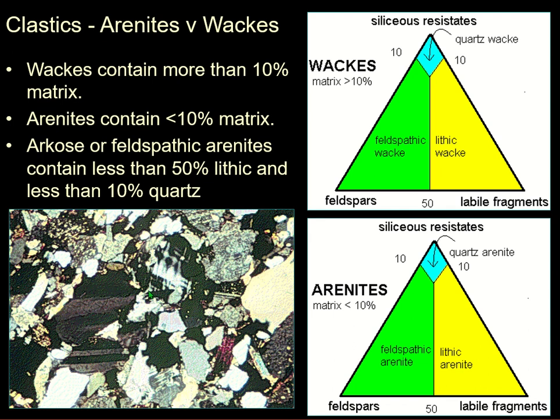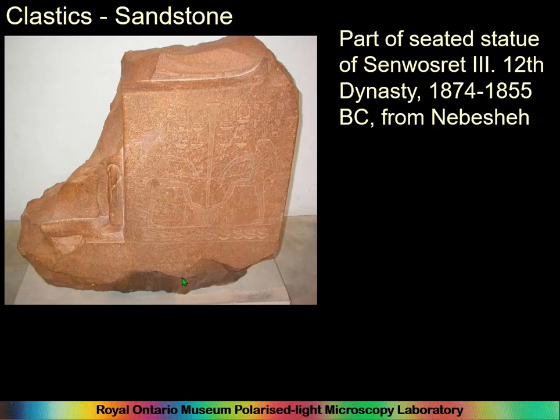You see here's a microcline. Remember microcline? There's one down here too, another one here. This photograph is kind of funny. Here's some plagioclase. So there's a lot of feldspar in here. So you could call this a feldspathic arenite or an arkose. So this is actually much simpler than all of this, so don't worry too much about all that.